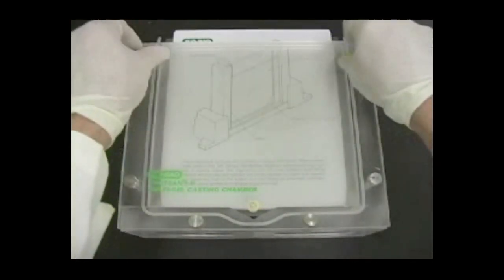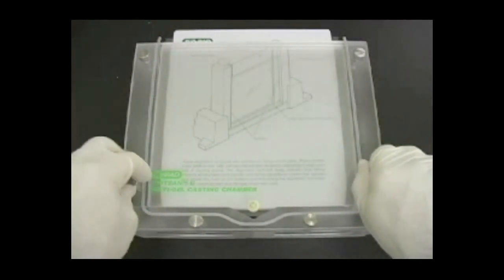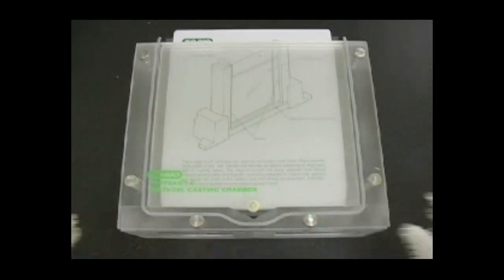Gradually tighten the screws in a random fashion until the plate is tight. You are now ready to cast your gels. Use the same casting procedure for single percentage and gradient gels as you would for the Protein Plus multicasting chamber.